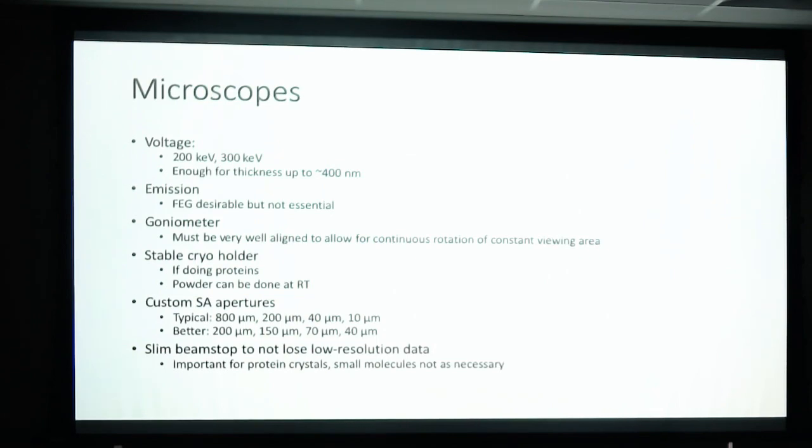If you're doing powder diffraction, you could do it at room temperature, I believe, and we've done a few proof of concept things. Probably if you collect it at cryo temperatures, you're going to protect it a little bit more from the beam. You'll have a slower rate of damage.